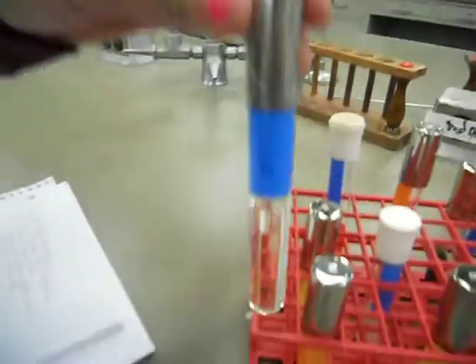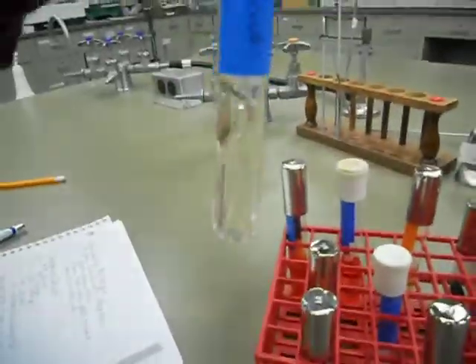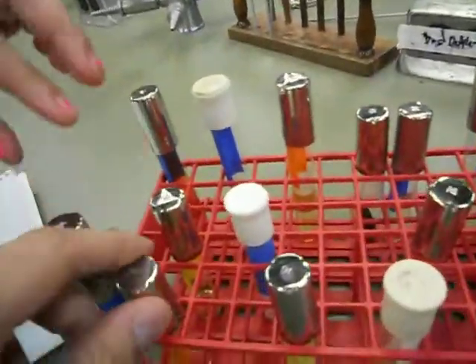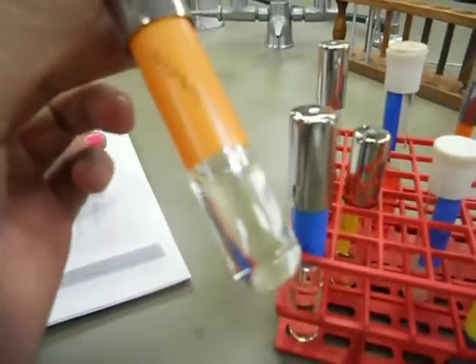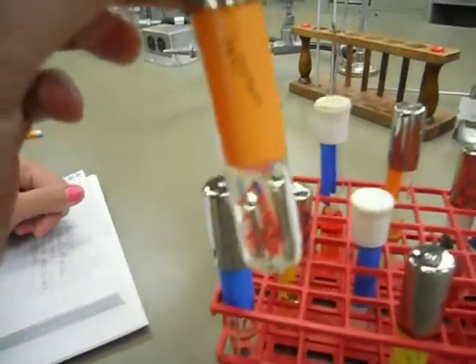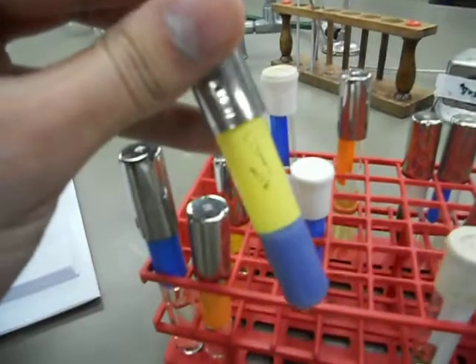So that's SSLB. That's a little weird thing in it — Durum tube. This is Trypto. You can't really be a Trypto fan. It looks like nutrient broth. Litmus milk.